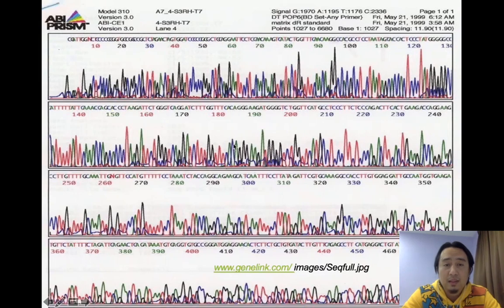For example, this one is C, this is A, this is G. So based on the graph, although it is short, the spike is sharp upwards, which means that surely that is the correct position. But if you look at the bottom part, it's like noisy signals, right? So for the low ones at the bottom, for example, I take this one at the bottom, right?